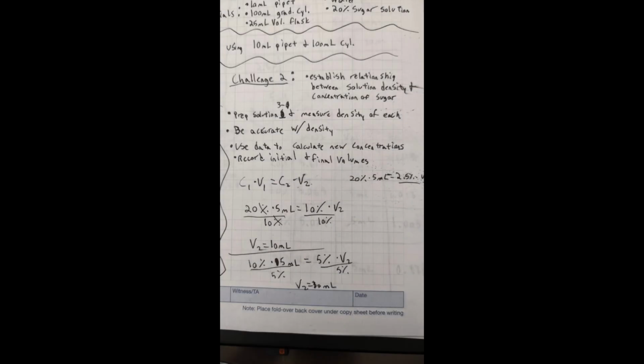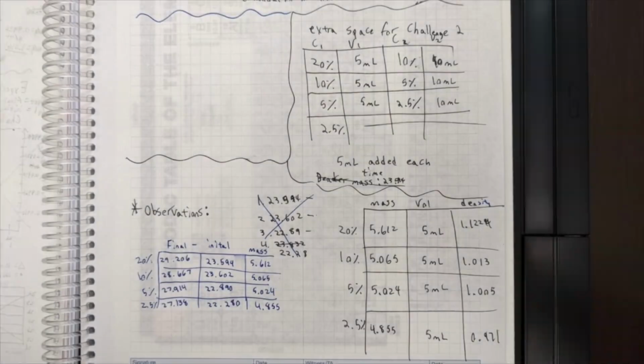Here are images of our calculations. We analyze this data to present our results.